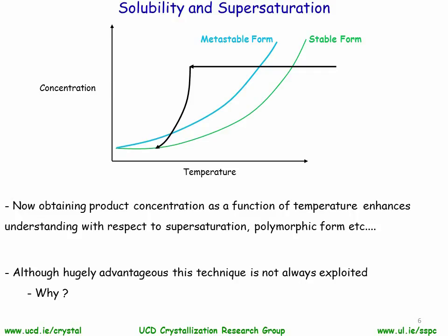Although this information is hugely advantageous in developing crystallizations, it's not always exploited. So I'm just going to introduce a couple of slides that maybe explain why this technique is not always used.